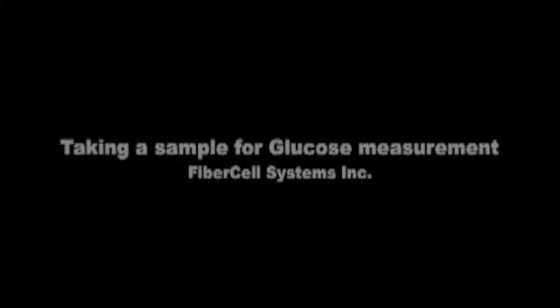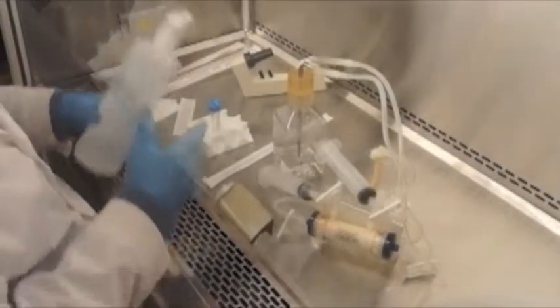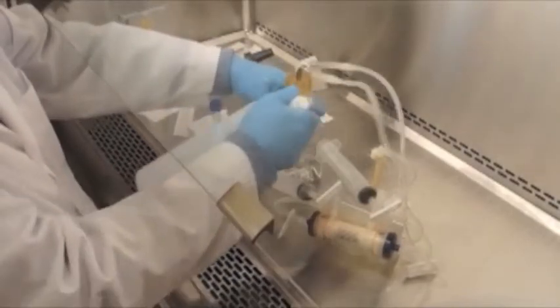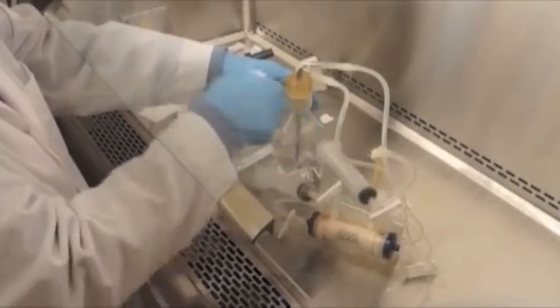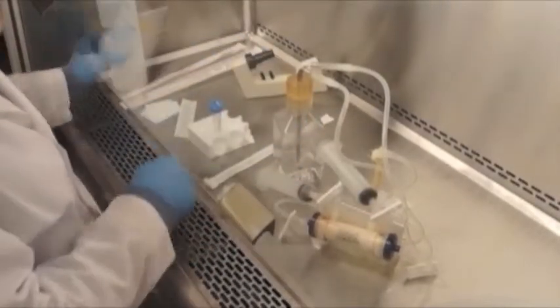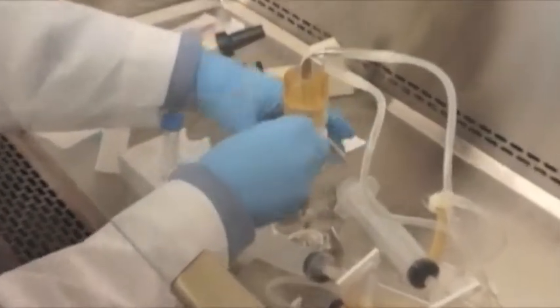It is important to monitor the glucose concentration in a reservoir bottle on a daily basis. The total amount of glucose present in the media tells us when it's time to change the media. When the media is about 50% depleted of glucose, it's time to change the media, or when it's down to around 2 grams per liter.